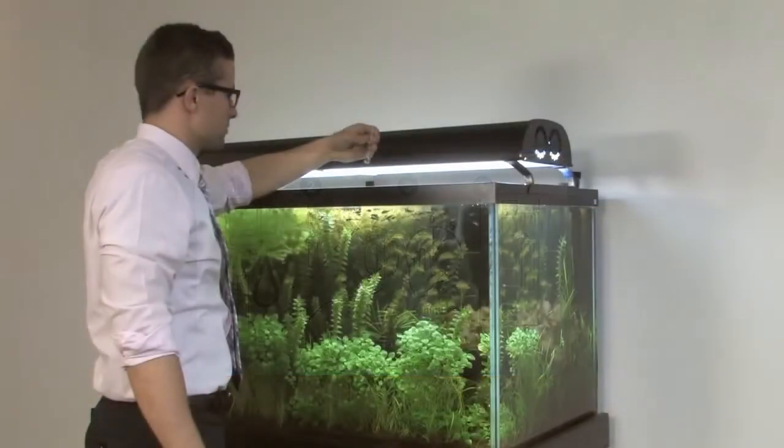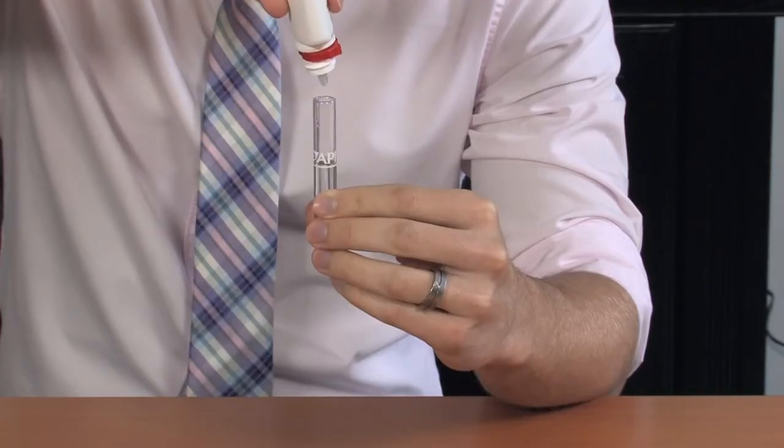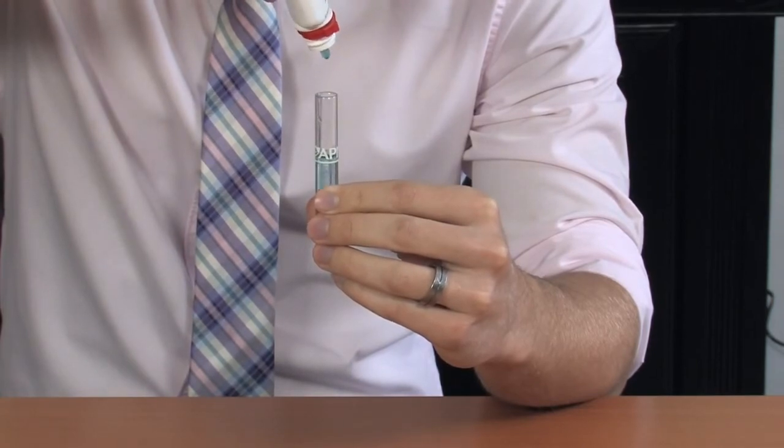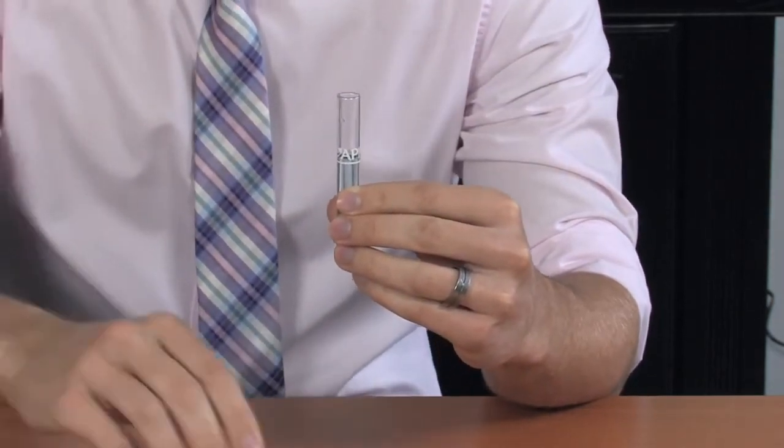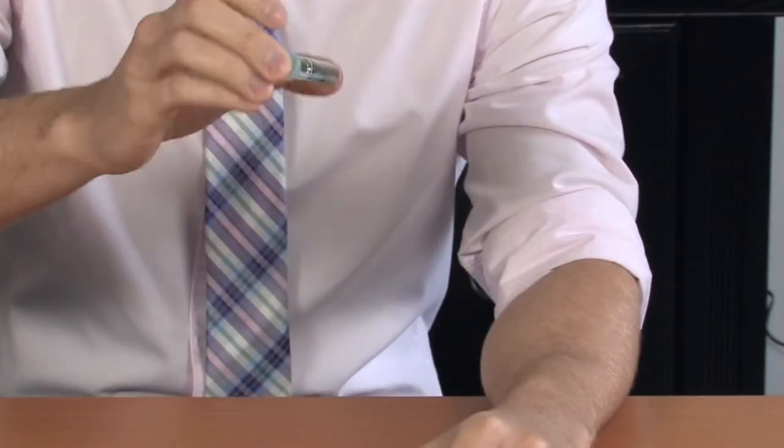Begin the test by taking a water sample from the aquarium. Fill the test tube to the line. Holding the bottle of test solution in an upright position, add five drops to the test tube. Be sure to cap the test tube and then shake the tube for a few seconds to mix the solutions.